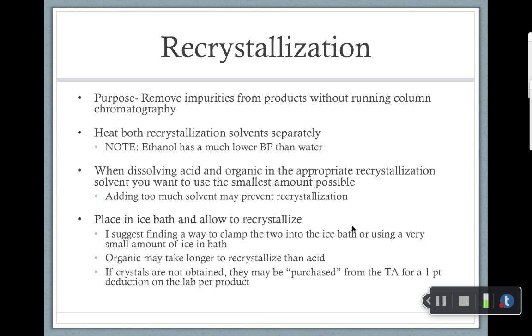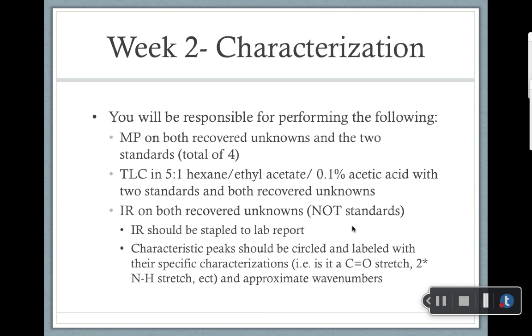One other important thing to touch on is that the organic may take longer to recrystallize than the acid. So if you have one that recrystallizes really quick, but the other isn't recrystallizing at the same speed, don't worry too much. It's possible that one takes longer than the other.